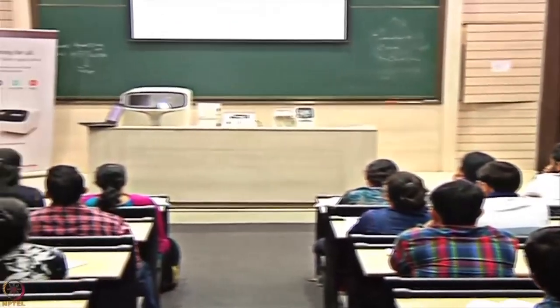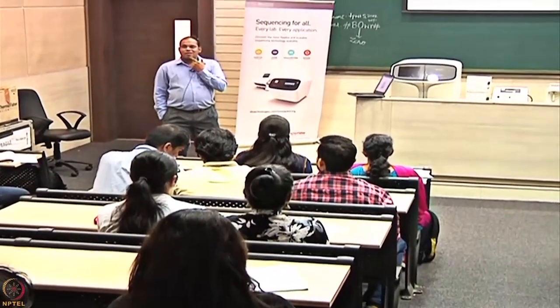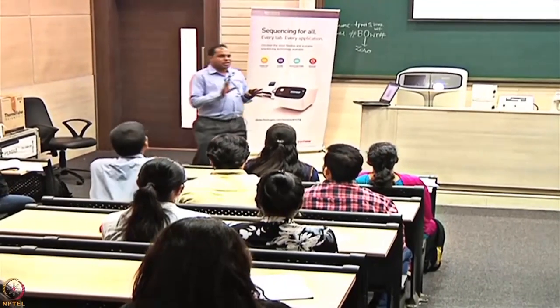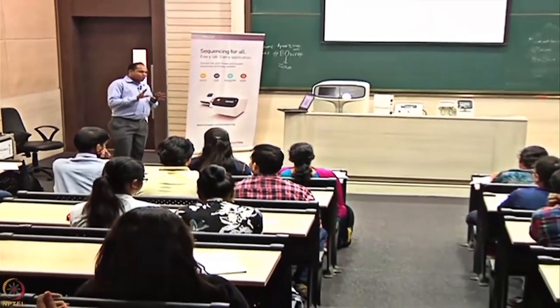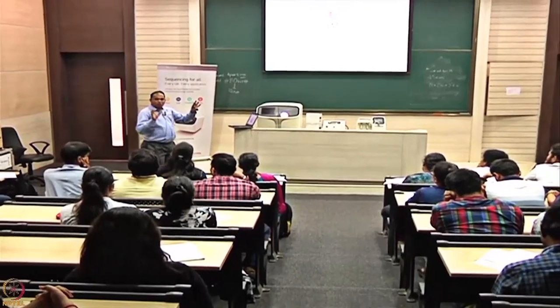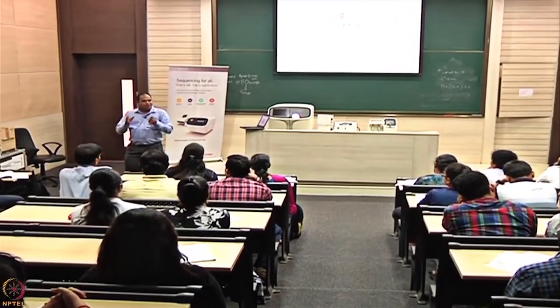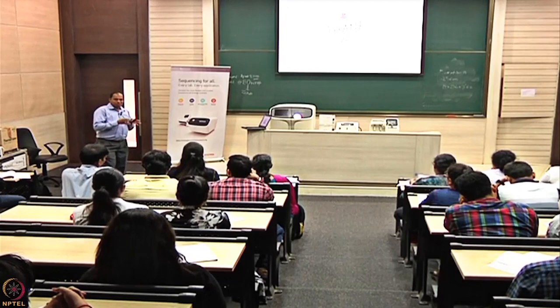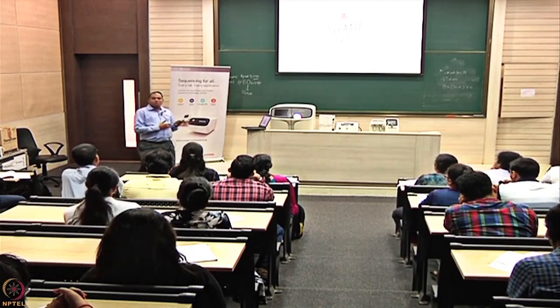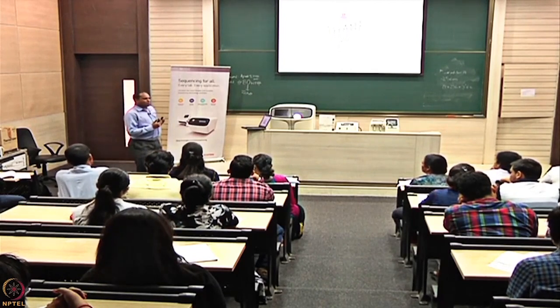Yeah. So, any questions about this? I hope you have got an idea or a feel of how the data analysis happens in NGS. The only thing over here was to take you through the entire workflow, how we start with the analysis, how we look into the particular gene designs, come to a level where you do the sequencing for the gene designs, and then get it annotated through Ion Reporter. It's a tool that is freely available, and for something like a quick response, there's the Oncomine Knowledgebase Reporter, which helps you to do that. Okay, so thank you very much for your time.